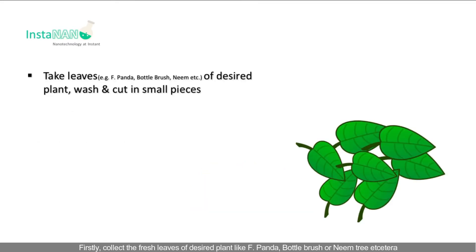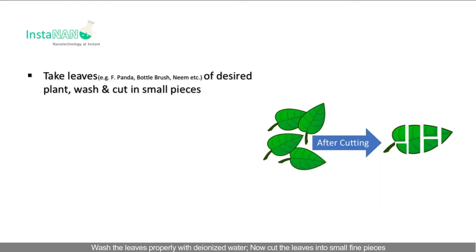Firstly, collect the fresh leaves of desired plant like Ficus Panda, bottle brush or neem tree etc. Wash the leaves properly with deionized water. Now cut the leaves into small fine pieces.